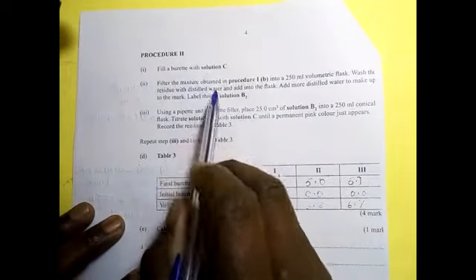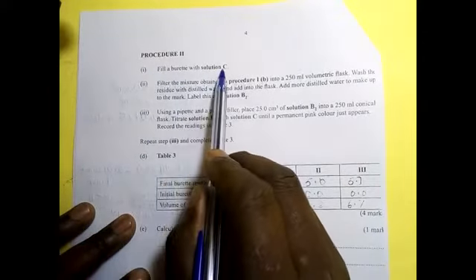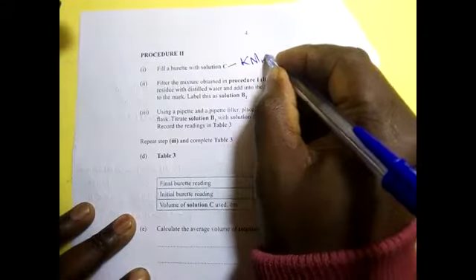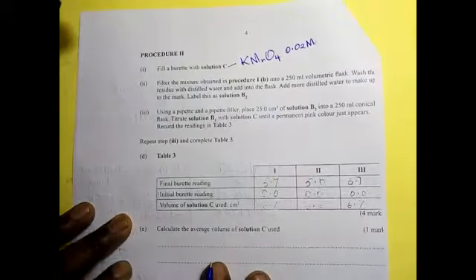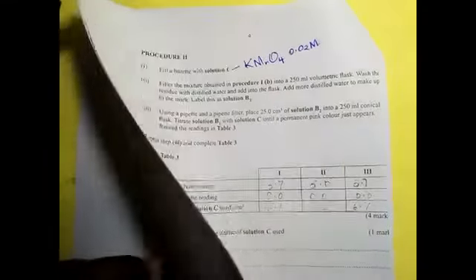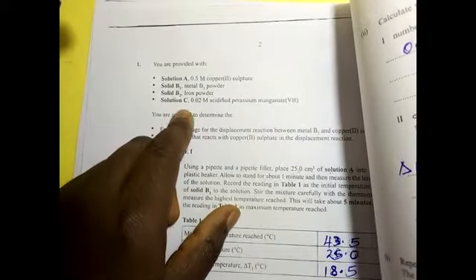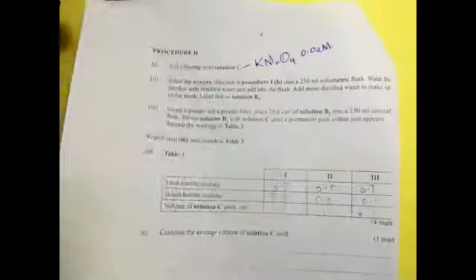Now let us look at the titration part of it. Procedure 2. Fill the burette with solution C. Remember, solution C is potassium permanganate and it is 0.02 molar. So that is something that you must always try to remember from what you are provided with. You are provided with solution C, 0.02 molar acidified potassium permanganate 7. Don't forget that.